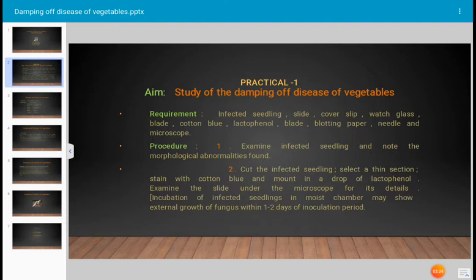In sterile condition, in the laminar airflow chamber, we add the sterile medium into the sterile petri dishes, and after 5 to 10 minutes the medium becomes solid in the plate.